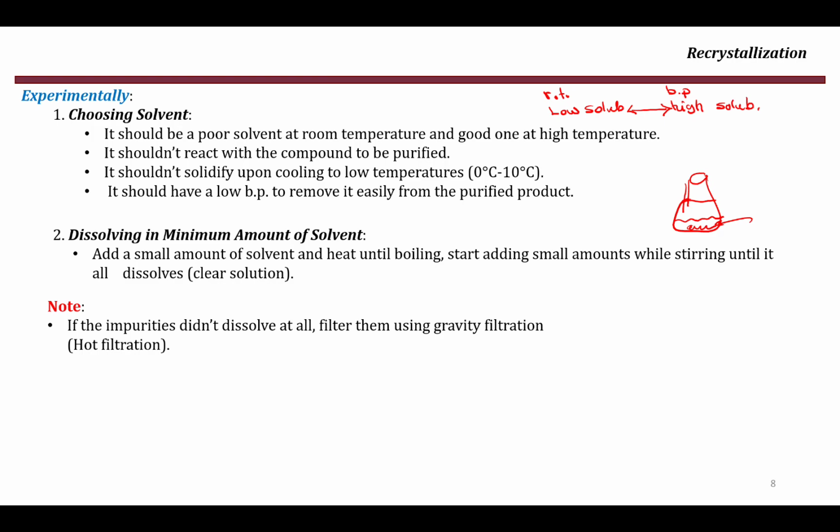Now, sometimes some impurities will not dissolve. Even after adding a big amount of the solvent, some of the impurities will not dissolve. In this case, we do something called gravity filtration, and it should be hot filtration. So make sure to say hot filtration, or pay attention to hot filtration. It's not a regular gravity filtration, it should be a hot filtration or a hot gravity filtration.